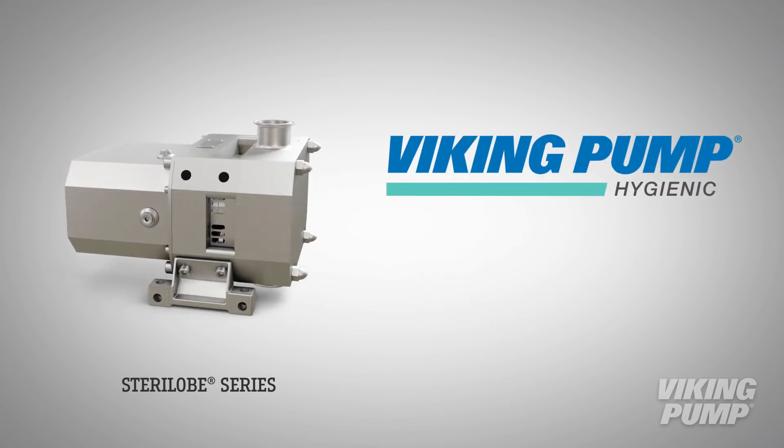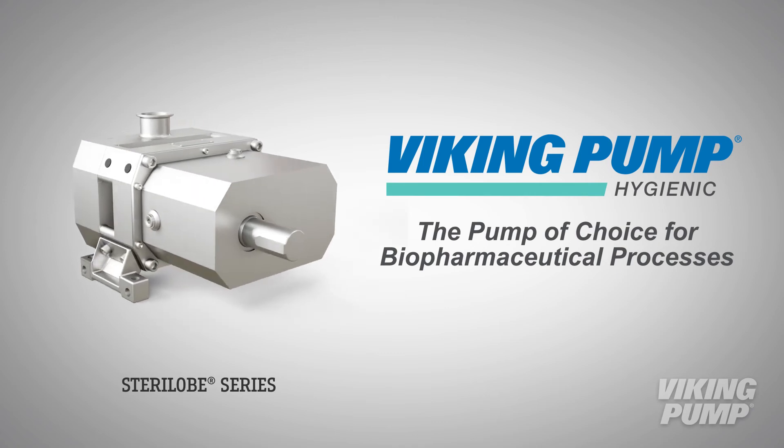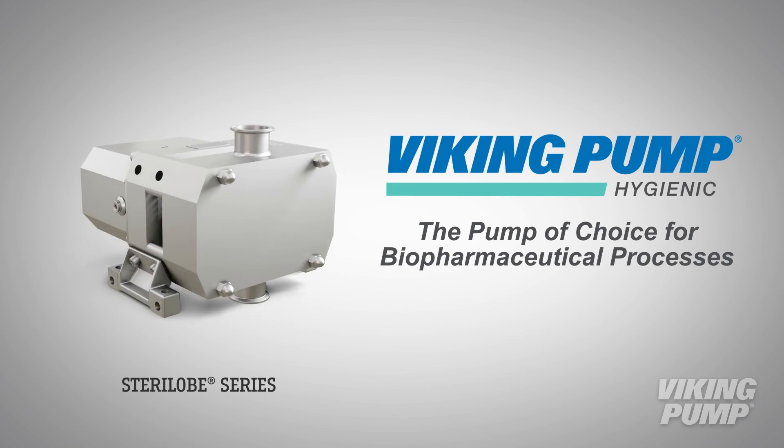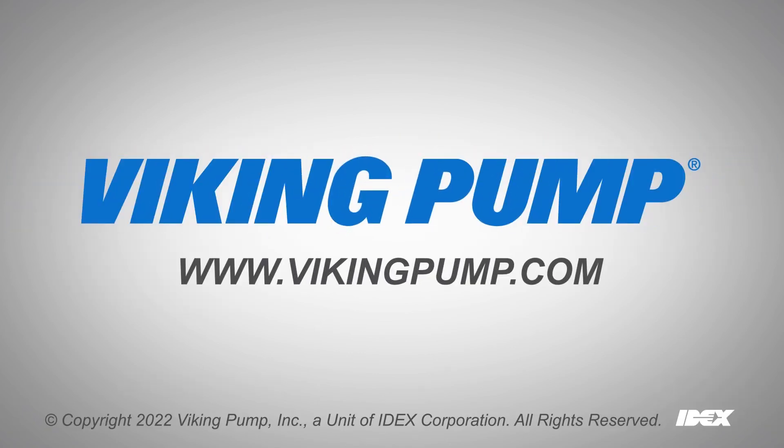Viking Pump's Sterilob Series Rotary Lobe Pump is the pump of choice for many biopharmaceutical processes. With gentle liquid handling and an ultra-hygienic design, Sterilob Series pumps will maintain the integrity of critical structures in process liquid. To learn more, please contact your local Viking Pump distributor or visit our website at VikingPump.com.